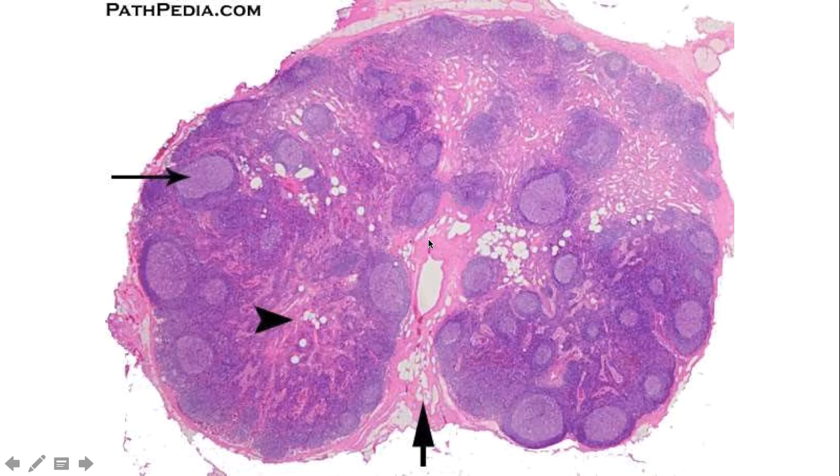Again, these major regions of the lymph node are the outer cortex, which is going to contain the follicles, and the inner medulla, which is not going to contain the follicles. In some cases, you can really see where this fluid is going to converge and then leave the lymph node, and this whole indentation is going to be referred to as the hilus. The last big structure that we can see here is that the entire lymph node is surrounded by a capsule, a dense irregular connective tissue layer that surrounds and supports the whole lymph node. This outer pink, collagen-rich area is going to be the capsule.